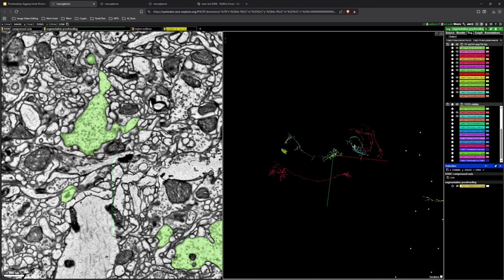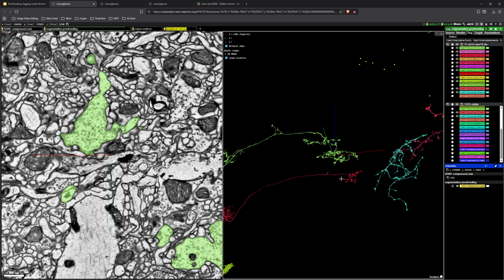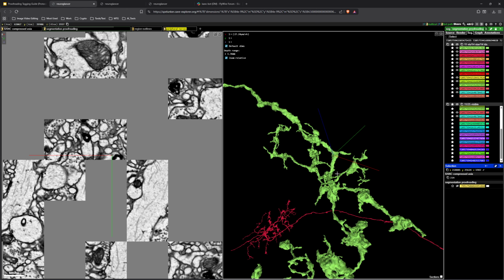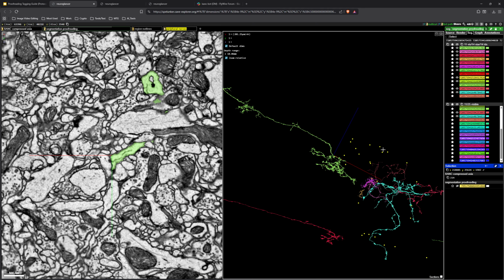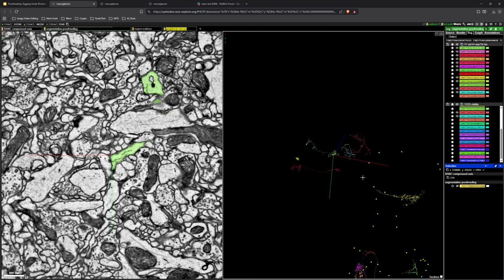So these are tagged ripped area in the sheet. So part of reviewing or validating whether or not a cell is ripped area is going to start with this peripheral nerve layer, since it very quickly tells you if it's ripped or not.